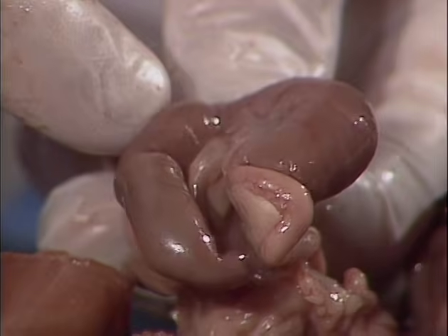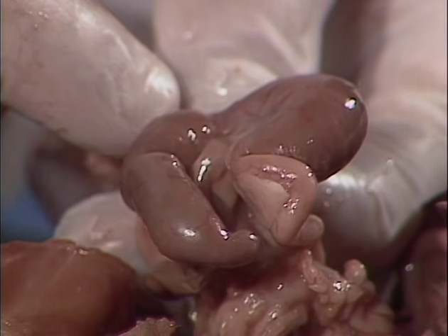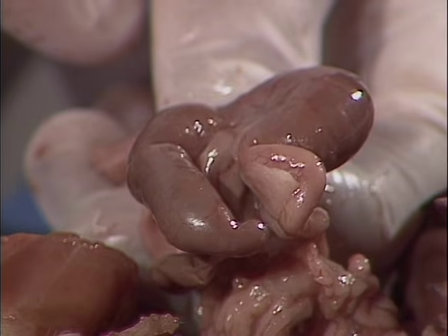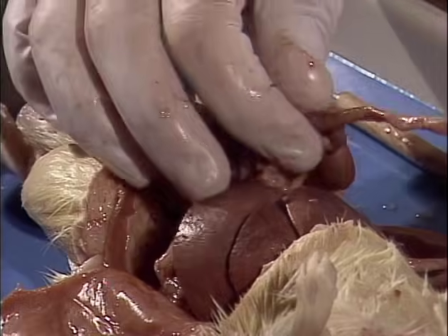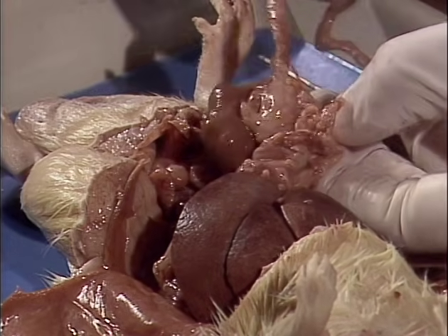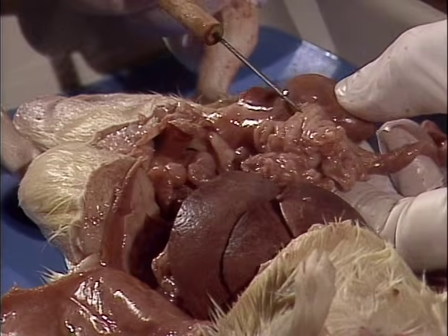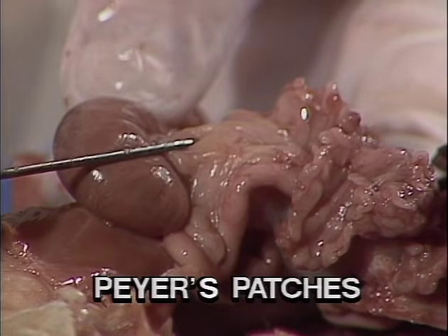The cecum has 2 functions, one of which is reabsorption. It reabsorbs water and minerals from the waste material. Another function is it acts as a place of fermentation where the plant matter ingested by the rat can be decomposed. If we look closely in the area of the last section of the small intestine, we will see some lumpy patches. These lumpy patches are lymph nodes and are known as Peyer's patches.